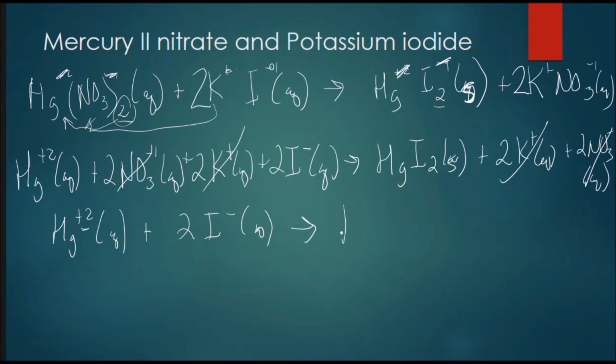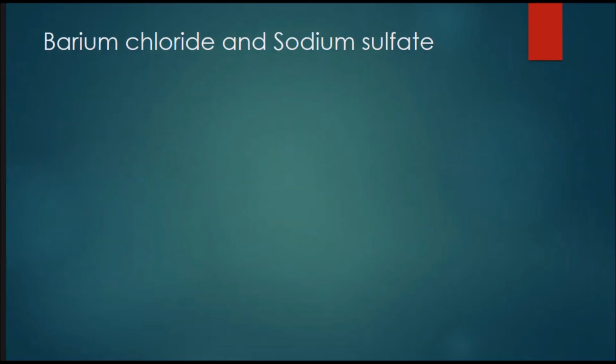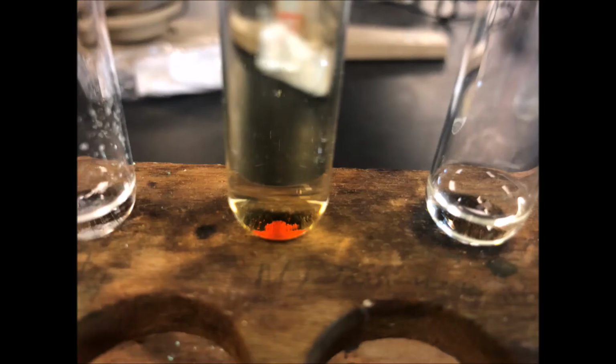The song does not give us all of the insolubles, just the most popular ones. And here's one that's not as popular. But it has to work. We saw the crystals, and it cannot be potassium and nitrate. Even though at first a lot of crystals seemed to have formed, in actuality, it wasn't that many.